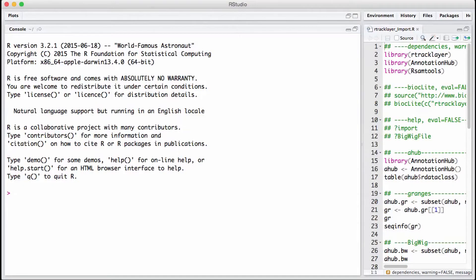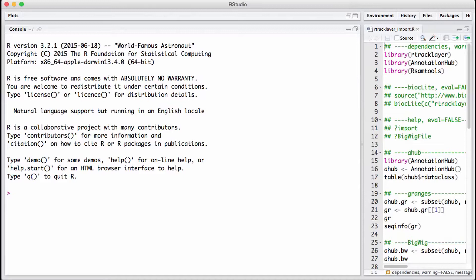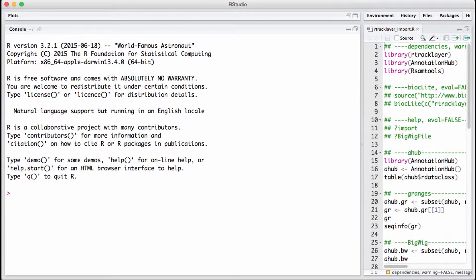For the purpose of this presentation, I will show you how to import data using the rtracklayer package. Before I begin, I'd like to tell you that we've been using the UCSC browser. The rtracklayer package lets you interface with the UCSC browser using the R programming language. Essentially, you can take data from the genome browser and put it into R, or vice versa.